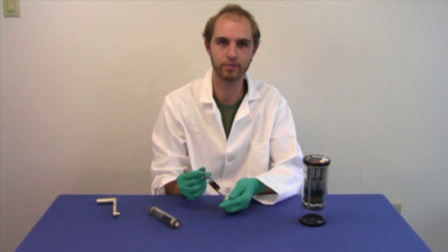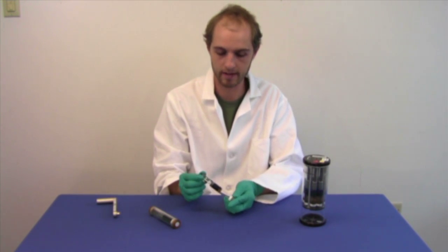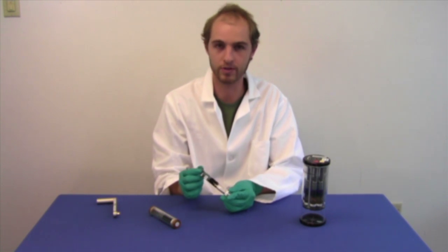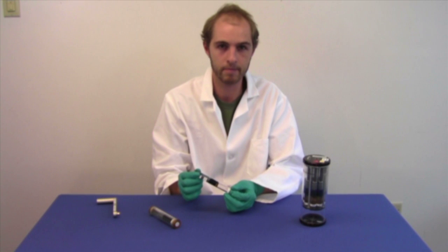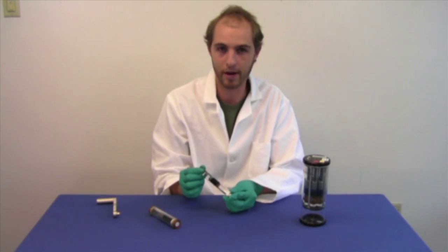With this hardware, you can fly any number of scientific experiments. Anything from growing a crystal to growing a plant to a small microorganism like a bacteria or a small invertebrate. Good luck with your applications.